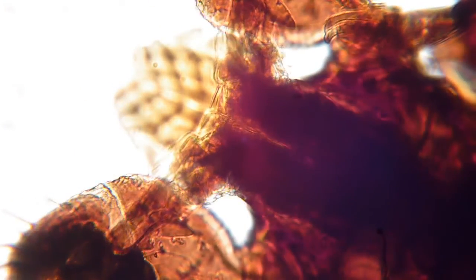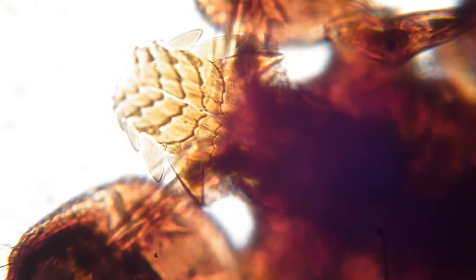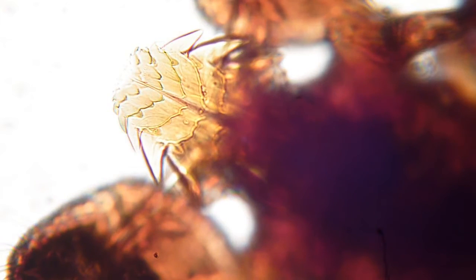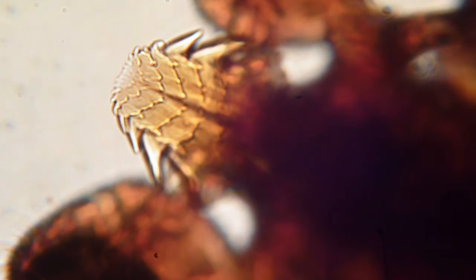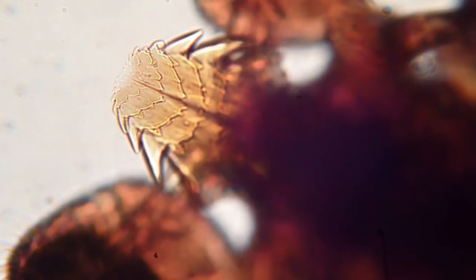Let's have a look here at further magnification. There's a very clear sawtooth structure that you see. Now when I focus all the way through it, I have to reduce the light a little bit. You can see the sawtooth structure of this part that the tick uses to bite through the skin to suck blood.